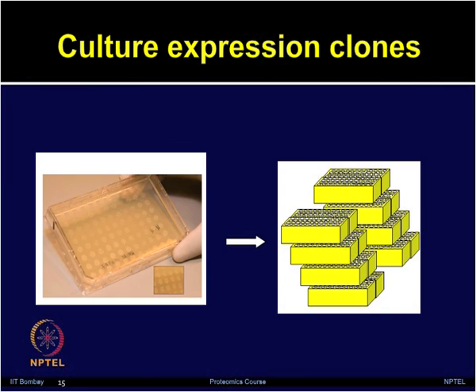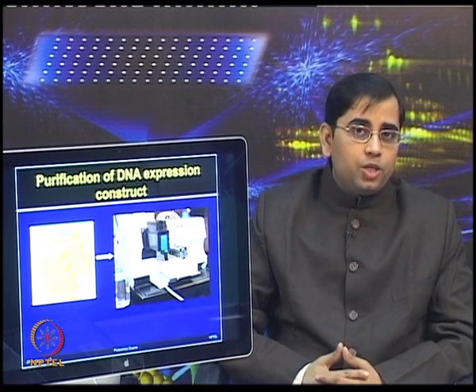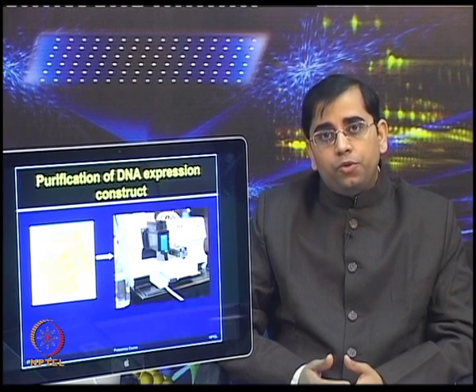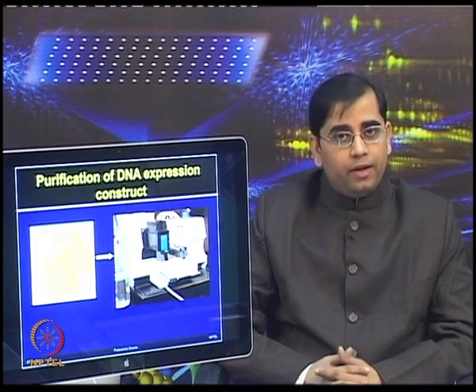For example, I have shown on the left slide the inoculated liquid cultures on the plate, LB-Agar plate, and then those can be used for inoculating a large number of blocks for doing the DNA extraction. Now, all these steps need to be modified in such a way that you have less manual intervention. If you do a lot of pipetting yourself, there is a good possibility of introducing various types of errors.